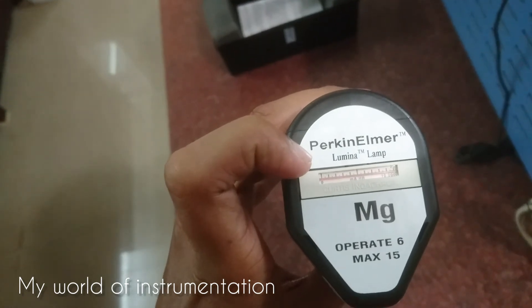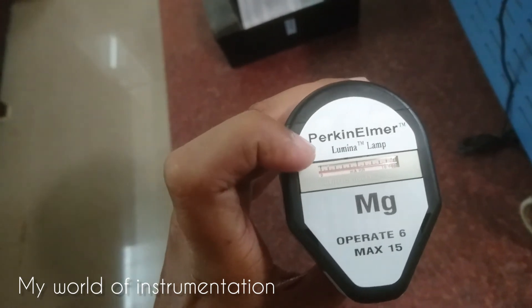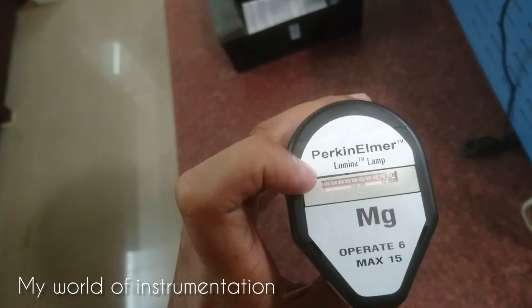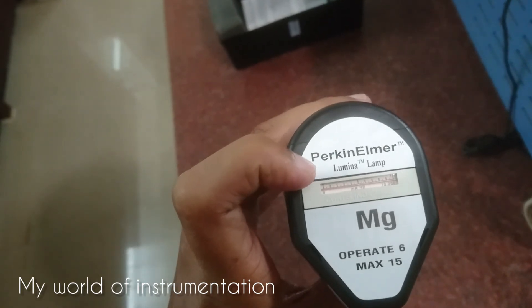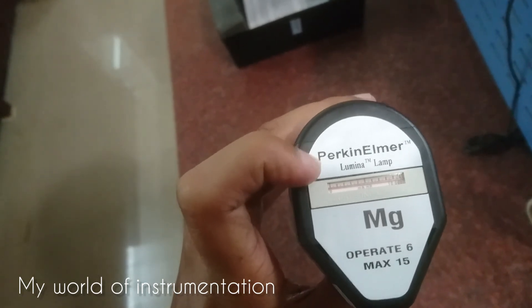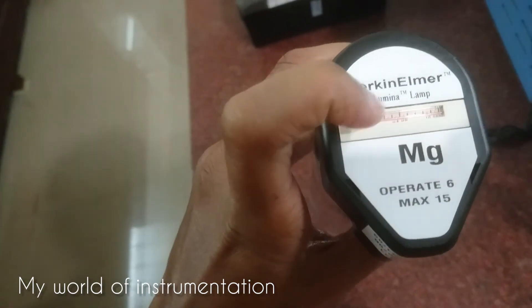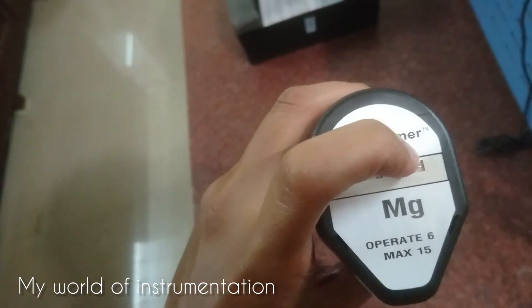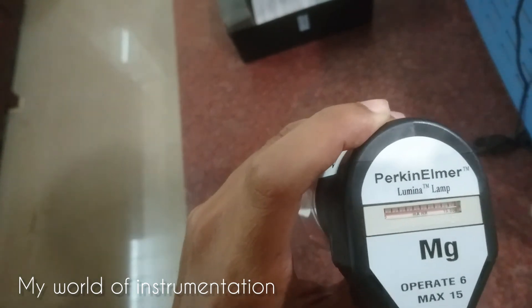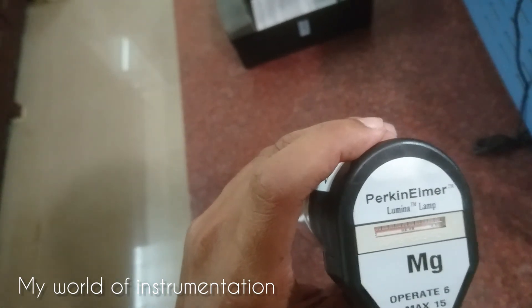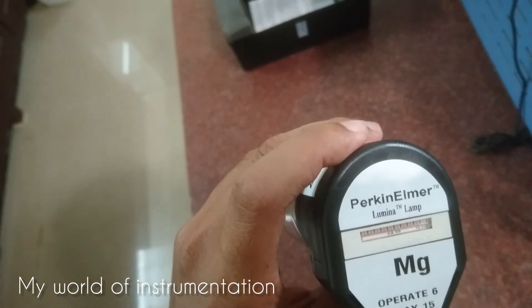This is a hollow cathode lamp milliampere hour meter. This meter measures the number of milliampere hours that your lamp has operated. The range of the meter is from zero to 10,000 milliampere hours. This information will assist you in determining when to replace a lamp.